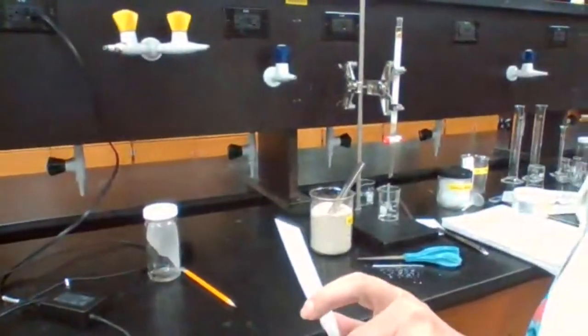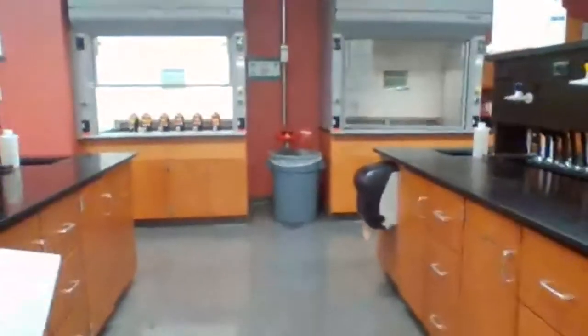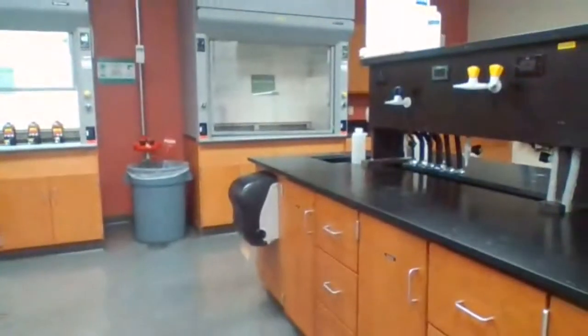We are going to take this to the UV lamp and try to visualize it under the UV lamp. Where is the UV lamp?